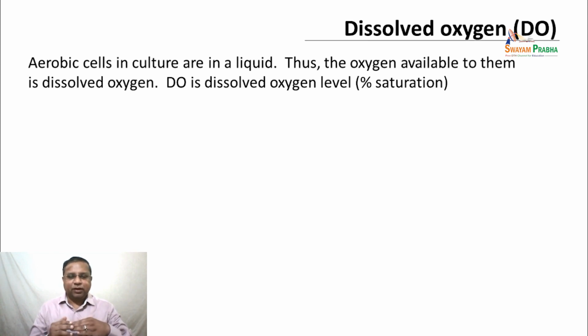Both keep happening, and at a certain stage, the rate of oxygen movement from the gas phase to the liquid phase equals the rate of oxygen molecule movement from the liquid phase to the gas phase. This is the condition we call equilibrium. The concentrations, of course, bear a certain relationship that is given by Henry's law when the equilibrium is achieved, but they are not equal. You have 21% oxygen in the air. You have probably around 8 ppm under standard conditions.